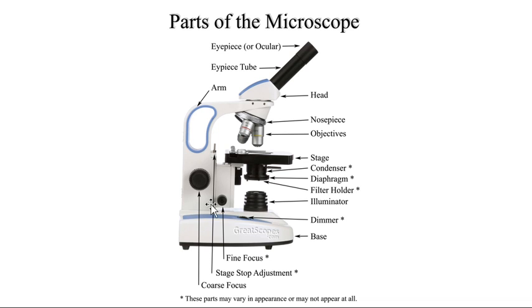This is the arm having coarse adjustment and fine adjustment. This is the stage which has clips to fix a slide. This is the substage which has two parts: condenser and diaphragm, which are adjusted to control the illumination.